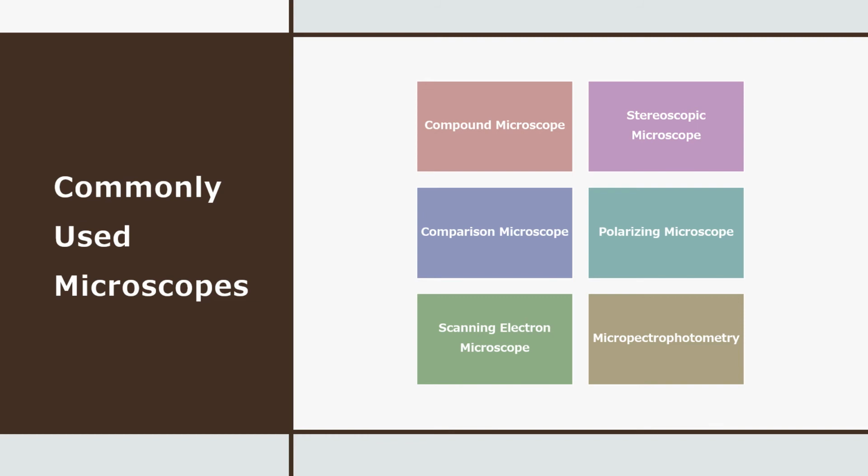But a stereoscopic microscope employs many of the same principles as a compound microscope, but it does not magnify nearly as much as a compound microscope. In addition, its light source illuminates the object that it's viewing differently from a compound microscope. So it's not just the lower resolution and therefore more useful in giving context, but you'll use it with certain different needs as well.